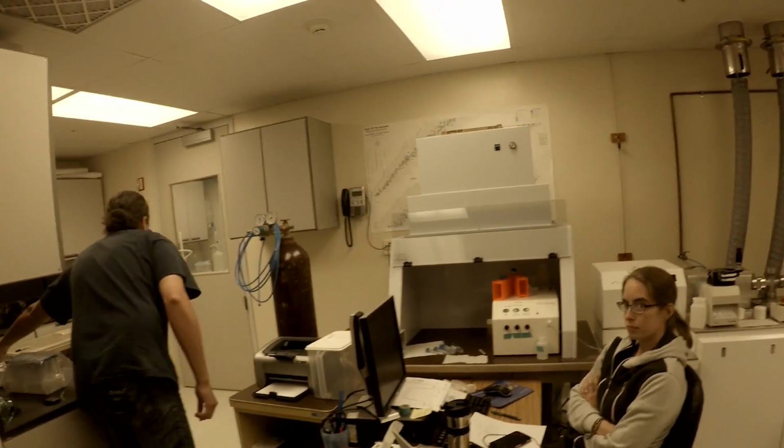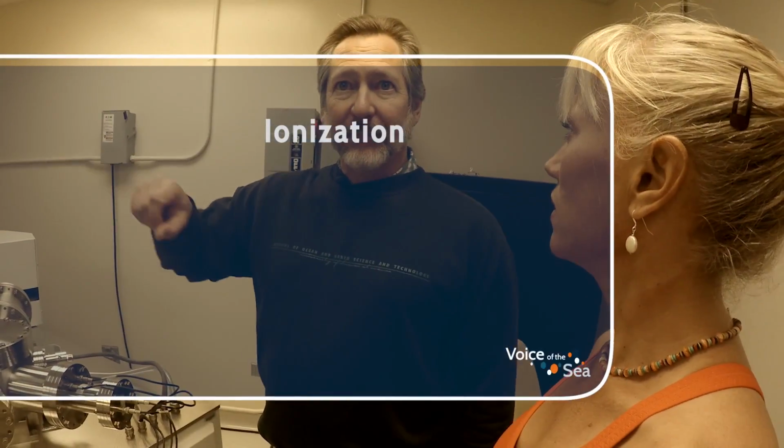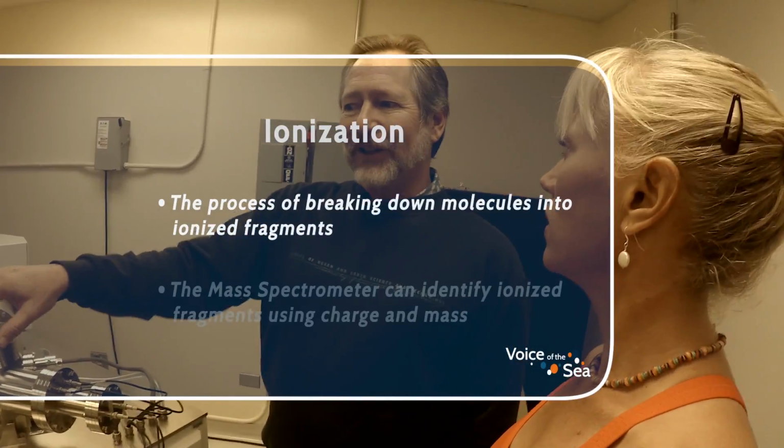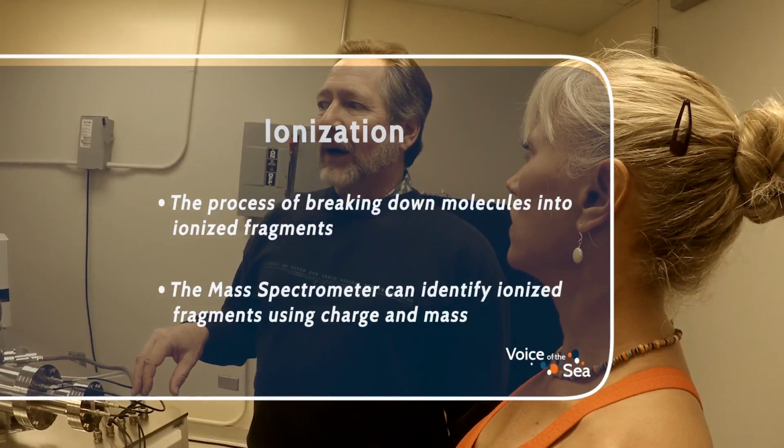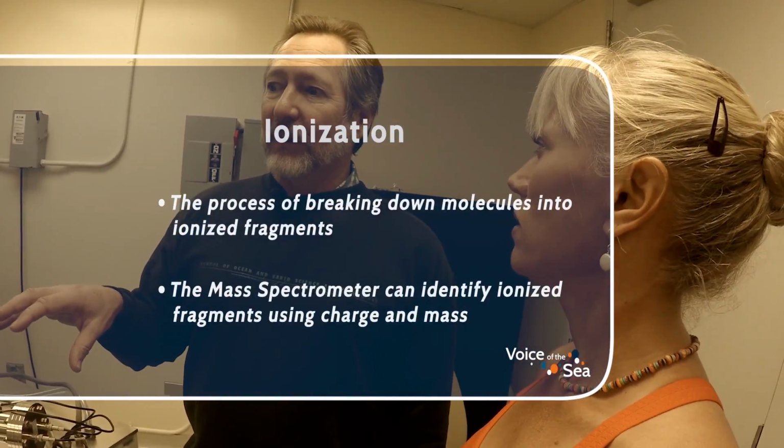With mercury, what we do is we burn the sample in a really clean environment in the clean lab and capture that as a salt in a solution. And that solution containing the mercury from a fish or from a crustacean, a shrimp, is then fed into the plasma to ionize the mercury. There are a little bit different details. There's a hydride generator, which is required for the mercury analyses.